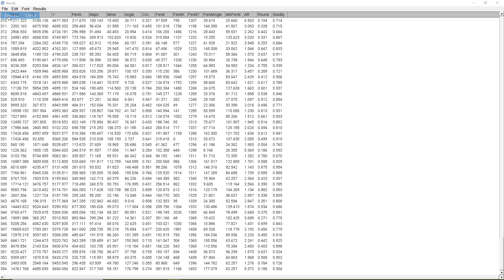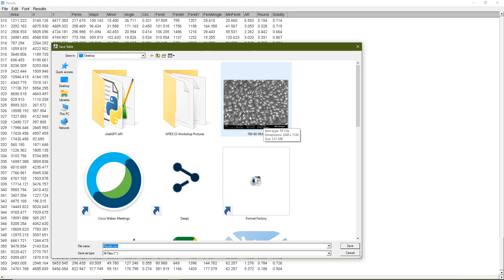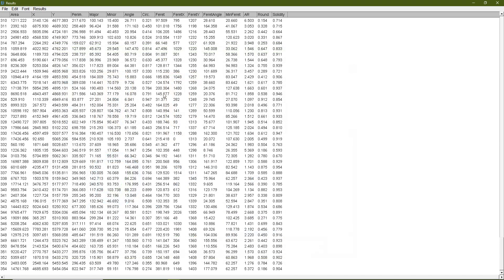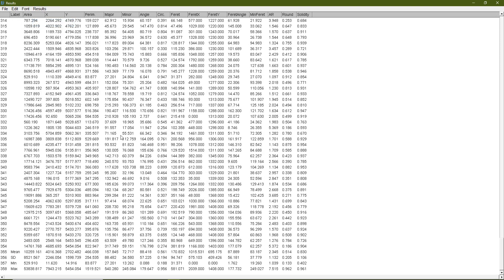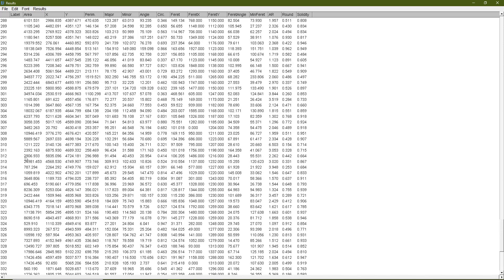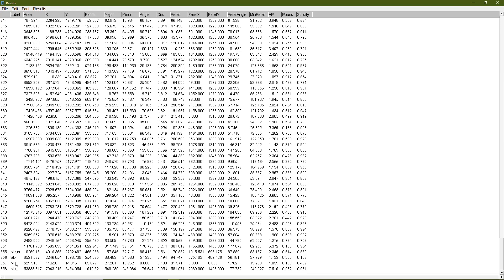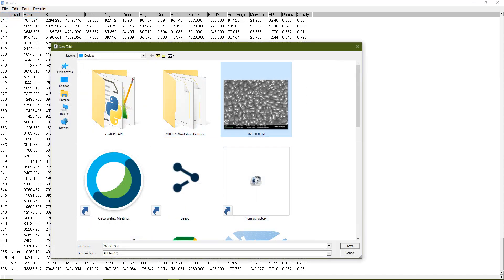We need this data, so I go to File > Save As and save it — usually I select the file and name it with an underscore 'stats'. Before doing this I go to Results > Summarize, so it writes the mean, standard deviation, minimum, and maximum at the bottom four lines of the file. Then I save as a CSV.